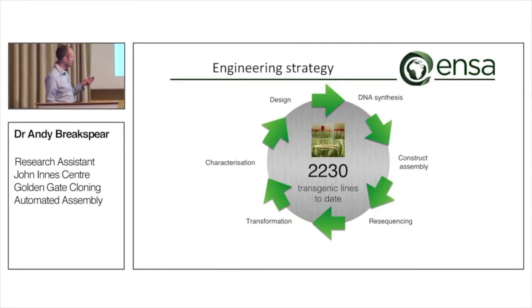So we settled on an engineering strategy towards the beginning of the project, and it starts, like most people's, with synthesizing these DNA parts we heard a lot about yesterday. You then put these parts together in a single pot reaction to produce your construct that you want to transform into the plant.